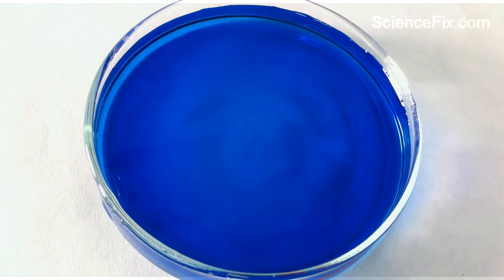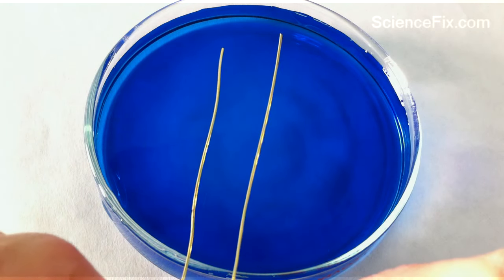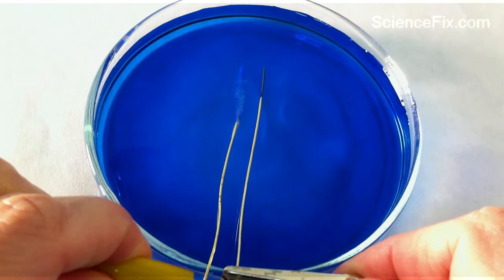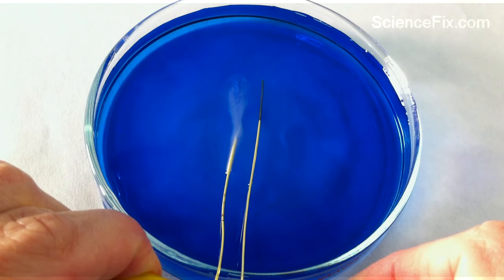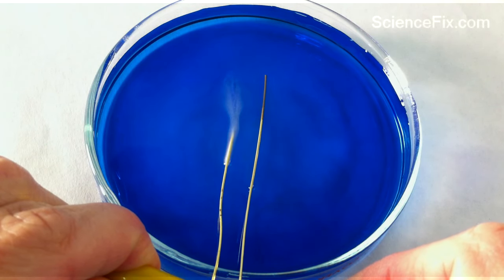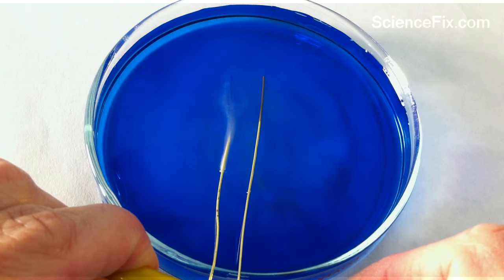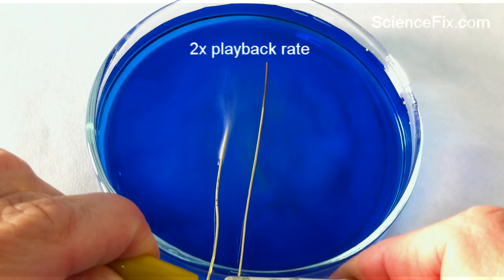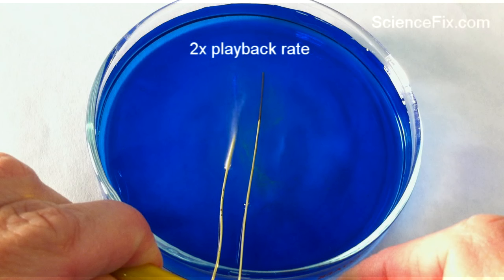Then you put the two wires into a solution of bromothymol blue. In the bromothymol blue solution is also some salt so you can get the electricity flowing through the water very much easier. You can see electricity is flowing between the two wires and you have bubbles forming, so that's the oxygen and hydrogen gas forming.